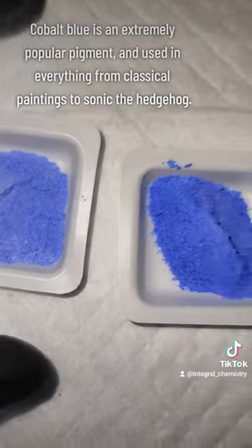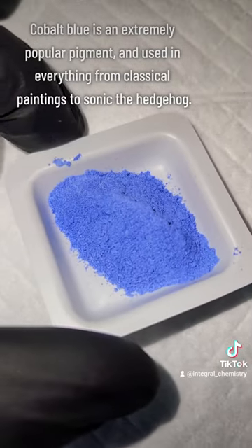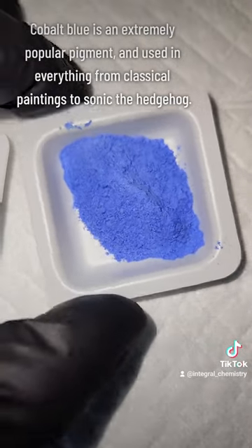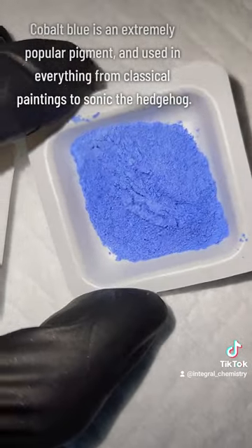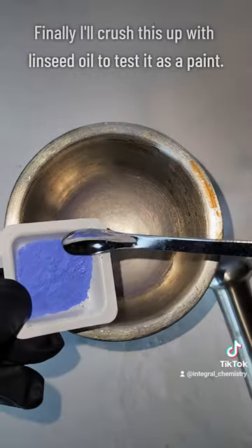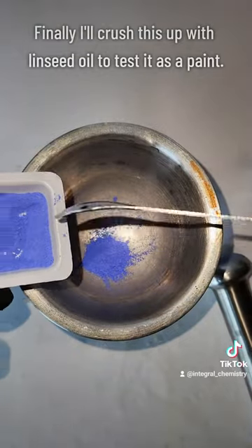Regardless, this is my final product, and as I mentioned at the beginning of the video, cobalt blue is an extremely popular pigment used in everything from classical paintings, to cars, to housing design, to Sonic the Hedgehog. Here's my favorite classical painting that uses cobalt blue extensively. The pigment really is everywhere.